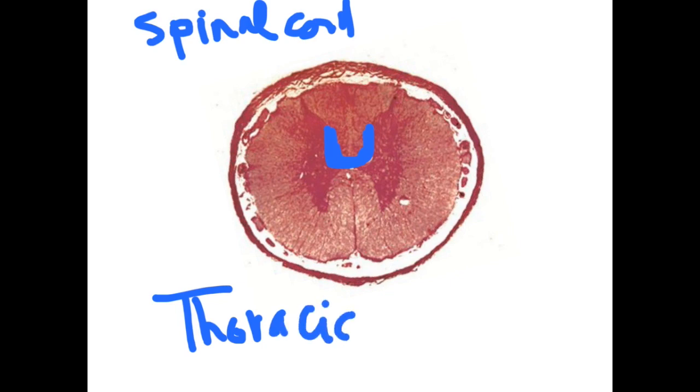Also, the section is more or less rounded. We have few criteria here. We have the difference in the sizes of the horns. They are almost similar. The absence of divergence of the posterior horn. And number 3, we have the rounded structure, and it is actually a small section.